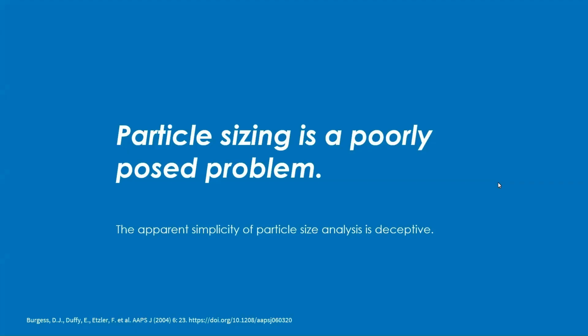First, I want to cite a statement from a paper shown at the bottom of the screen. That's the reference to the paper. This paper collected a lot of comments and feedback from the industry in the field of particle size measurement. In the end, it posed this statement, which I totally agree with, and I think captures why it's not as simple as I originally thought. The statement is that particle sizing is actually a very poorly posed problem. The apparent simplicity of particle size analysis is very deceptive.